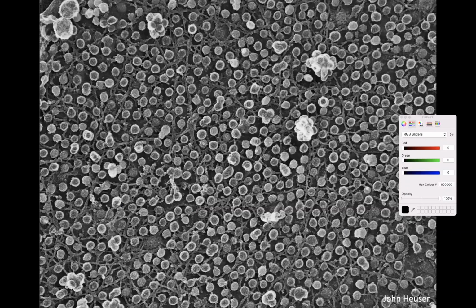So these are caveolae. This is a beautiful image sent to me by John Heuser, and you're looking from inside a cell at the inside of the plasma membrane, and you can see these pits. These are invaginations of the cell surface. You're looking at these little caves from the inside of the cell. And so these are caveolae, and you can see how abundant they are. They're about 60 nanometers in diameter.